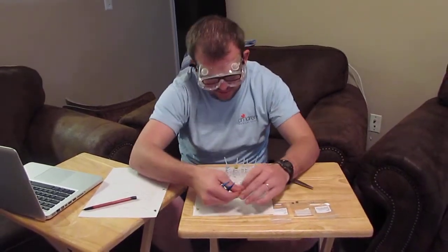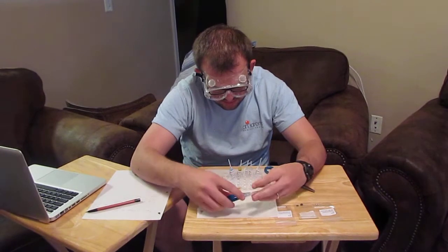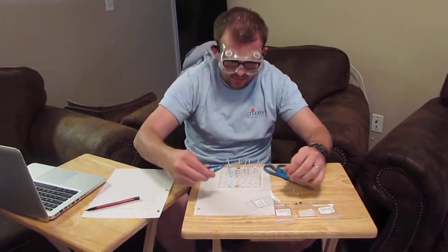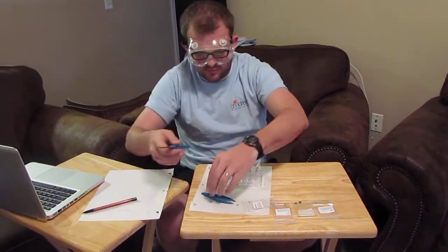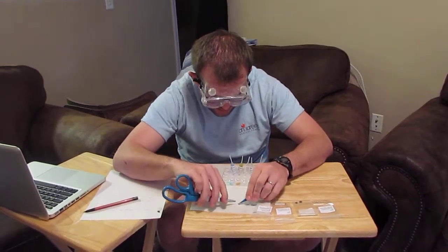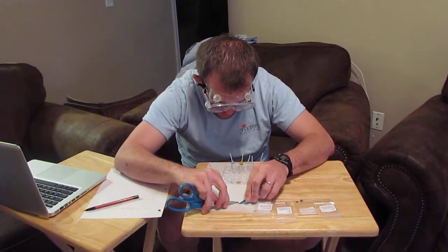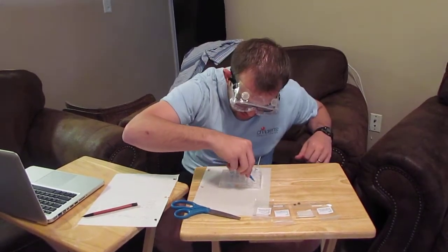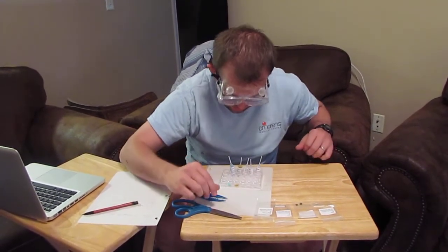I'm going to take my tweezers and try and get magnesium out without touching it. Use the plastic to my advantage. I'm actually going to rub it up against the scissors here to kind of scratch the surface so I can get a more pure reaction on the bottom of it. Okay. And we're going to put it in the first hole without getting the tweezers messy.